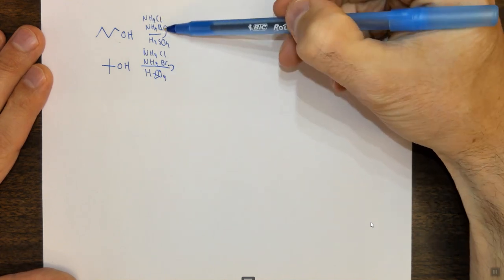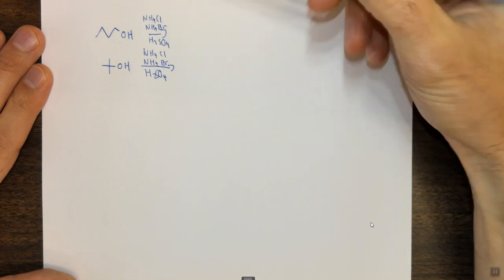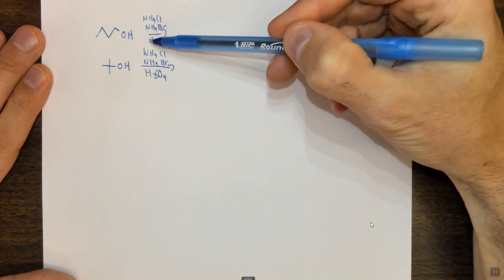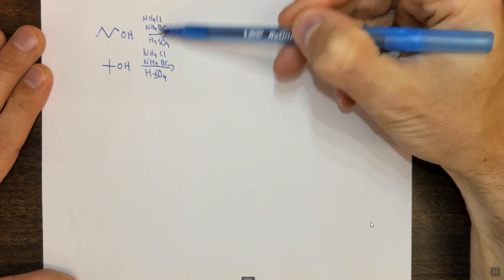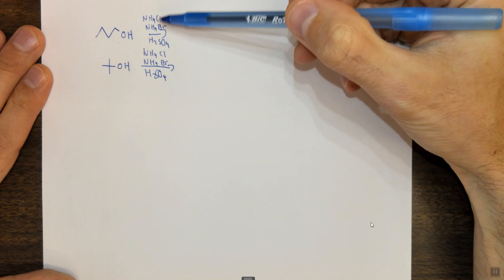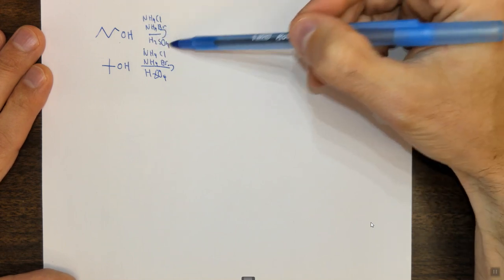Adding chloride and bromide salts to sulfuric acid seems like a terrible idea. Why? You're going to protonate Cl and Br, making HCl and HBr, which are gases. So remember that when you're doing this, you have to do it carefully, and I'll explain how to do it carefully later.